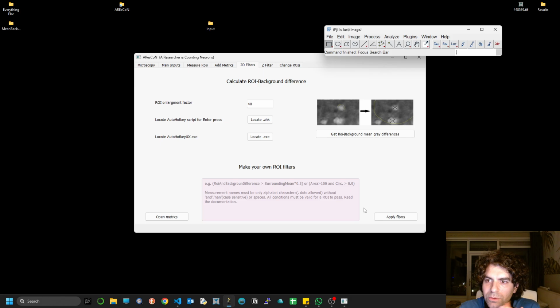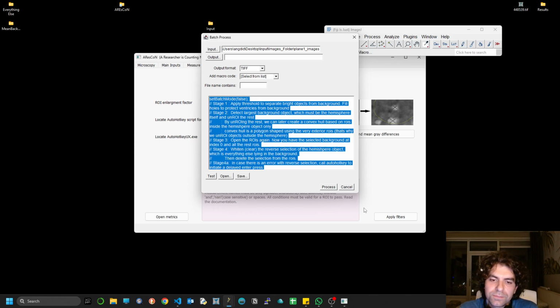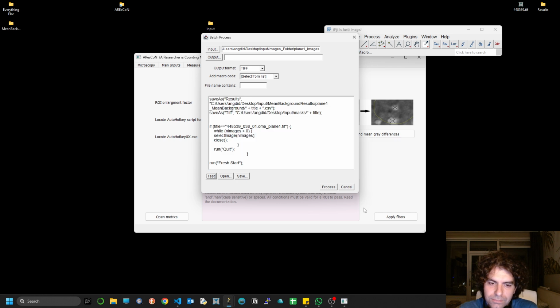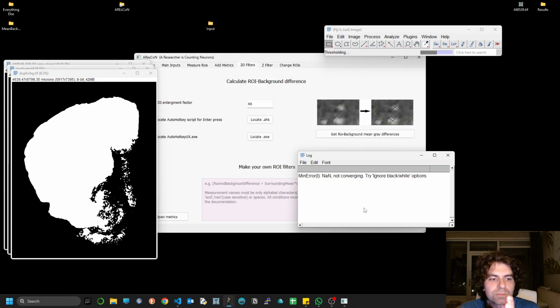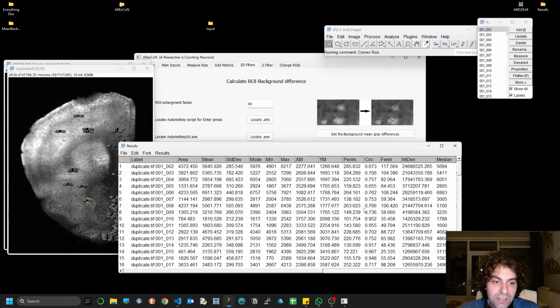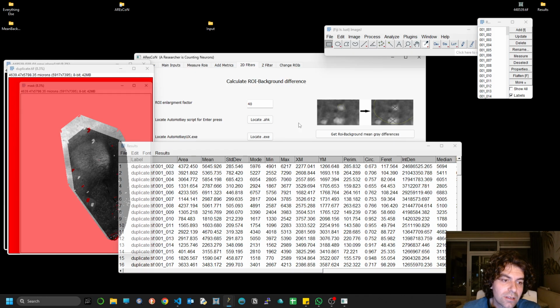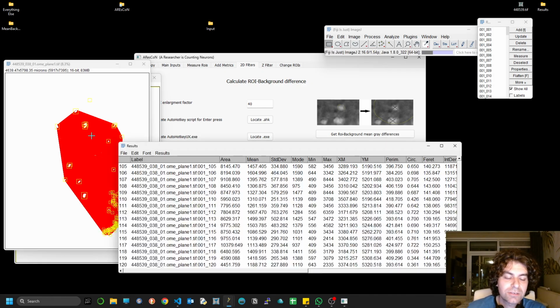In a few seconds, the macro will be typed again. That's right. Starting from plane 1. Beautiful. So what's happening here, in this scenario, is that this error occurs, as I told you, and now the AutoHotkey is actually intervening, and if you see, there is a small part that's cut out of the image, and this is a convex hull that's created.